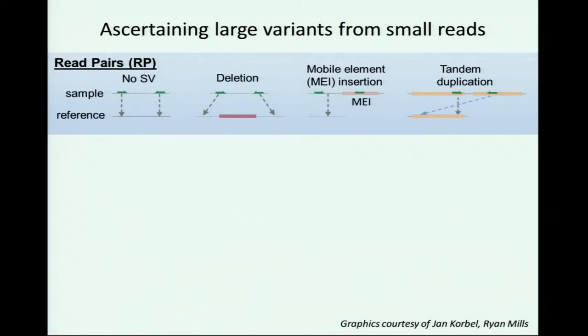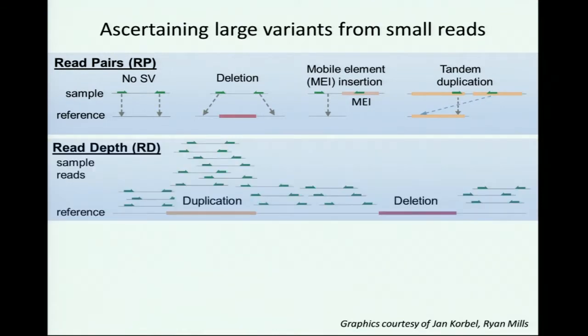And there's 3 or 4 sort of themes that people have used in structural variant detection software. One is to look at, if you have paired-end data, to look at the read pairs, because you have an expectation about how far apart the read pairs should be. You can look at if when you map those read pairs back to the genome, you get a different spacing than you would expect. And you can use that to detect structural variations. You can use that signal in the data.